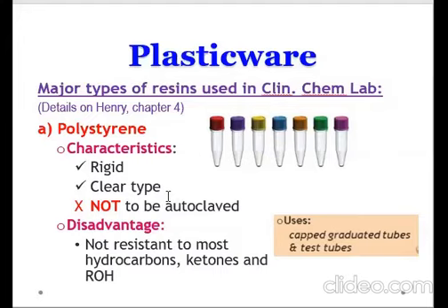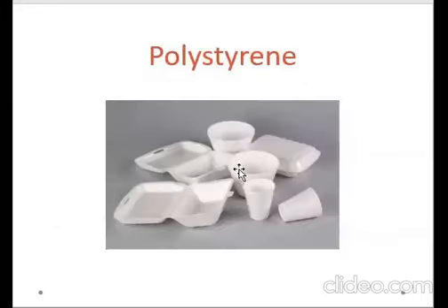Okay? So si polystyrene po, pwede nyo siya makita. It's actually a component of capped graduated tubes and test tubes like this one. Okay? Also, additional information again, okay? Your polystyrene can also be seen in your styrofoam. Kaya siya tinawag na styro. Okay? Because it contains your polystyrene.